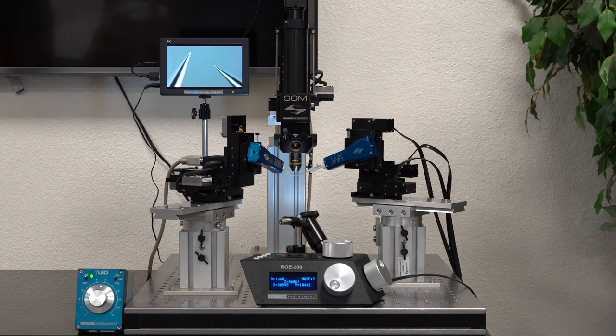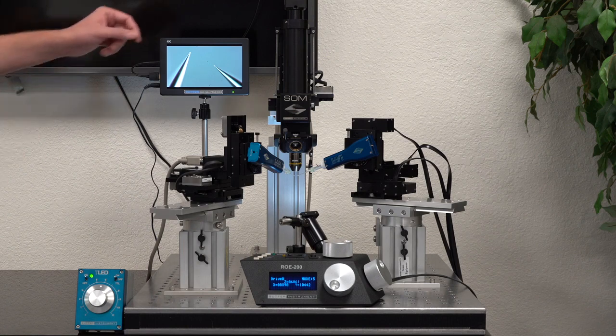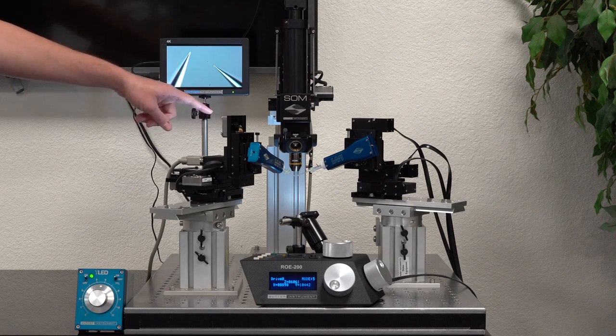The microscope height can be adjusted with the gantry height adjustment here and other gantry heights are available.